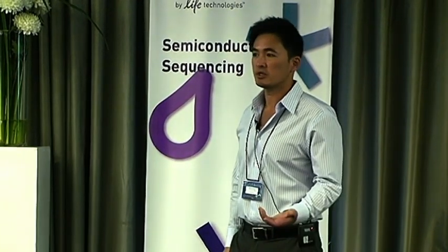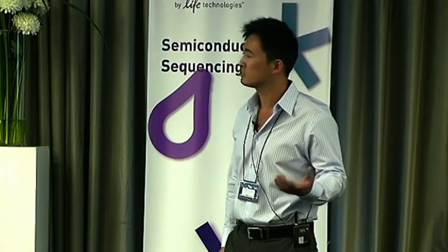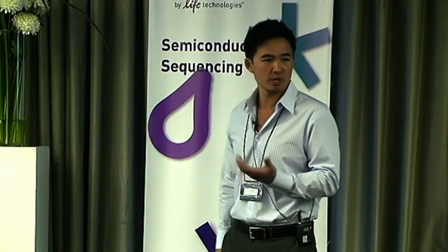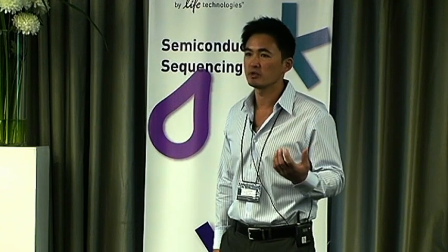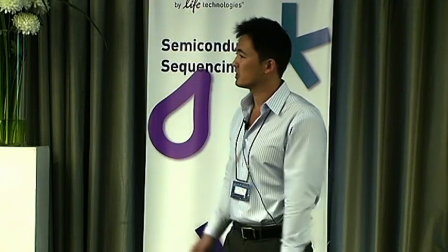And that's basically all that comprises the reaction, right? The assay was already in position. We added the master mix with your sample, and that was done by this automated loading device. So there's really no hands-on introduction for setting up this workflow.